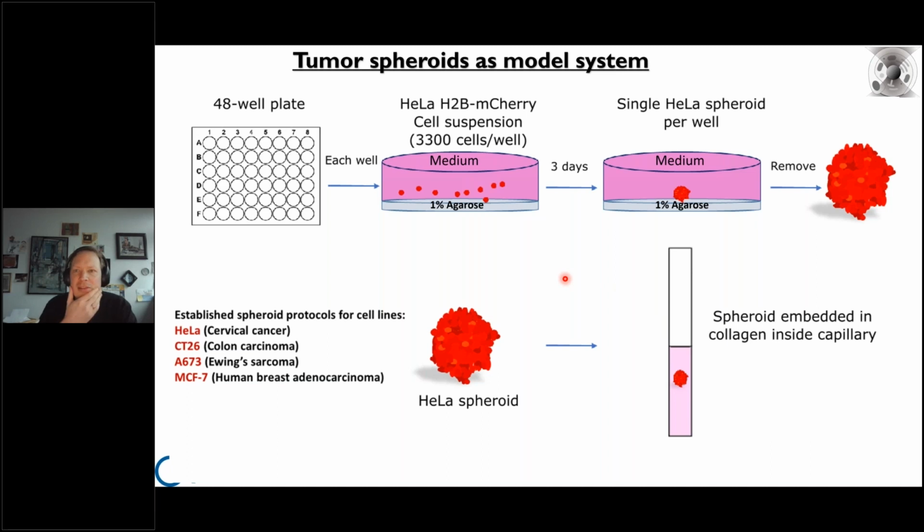How we did this was using light sheet microscopy. The way we prepared our model systems is a classical way of generating spheroids. You basically start with well plates with a non-adhesive surface. You add cells, and within about 3 days they form such spheroids, which you can pick up.